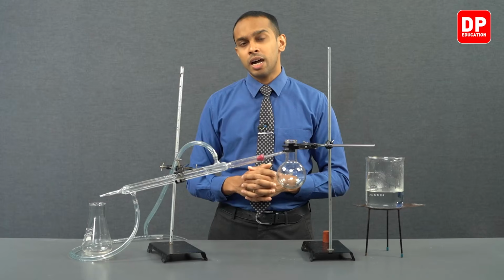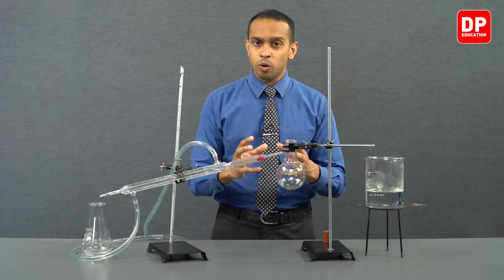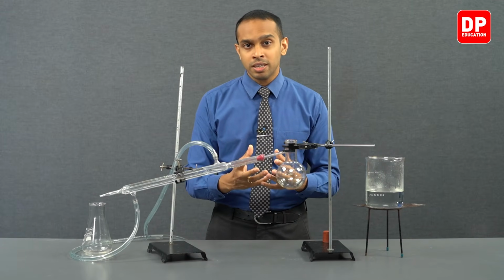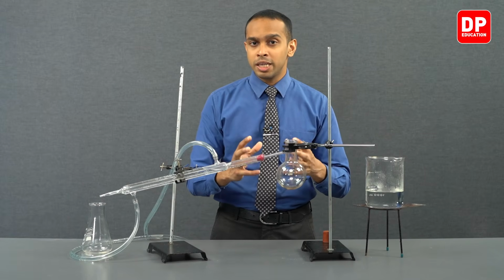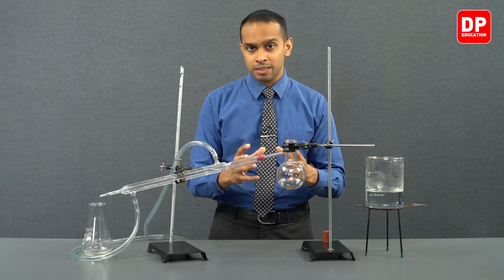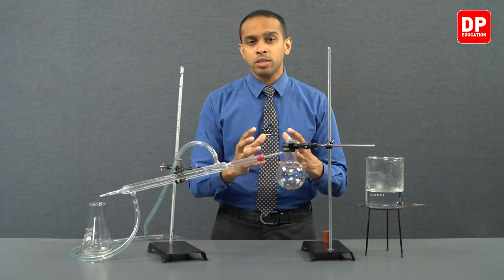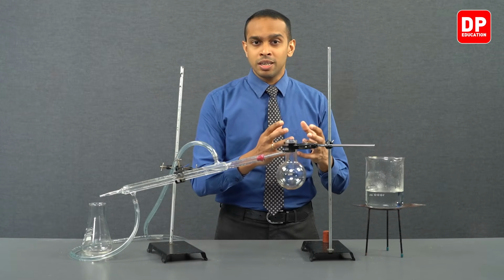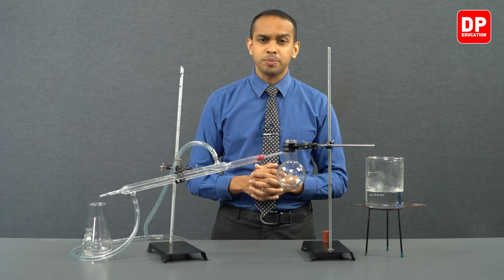When we were starting this experiment, we cut the cinnamon leaves into small pieces and added them to a round bottom flask, and then we added water to it and directly heated the round bottom flask. As we directly heated the round bottom flask, the water got heated up, and along with it, the pieces of cinnamon leaves also got heated.